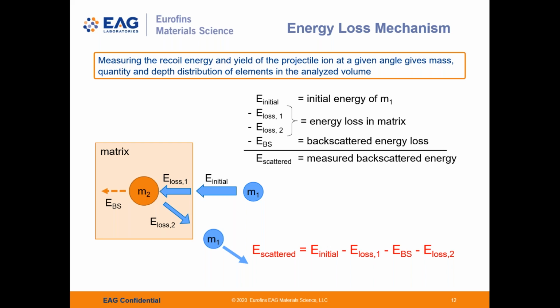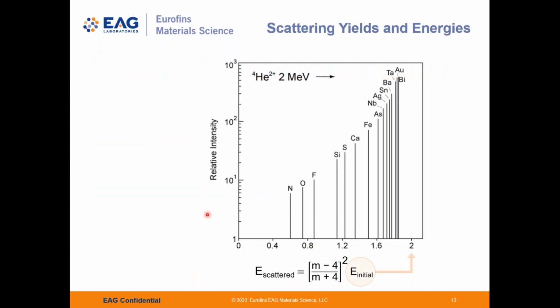Now, let us begin with the case of no energy loss due to transmission through a matrix, just atoms of different masses and sizes at the surface of the sample only, in the next slide. This plot shows the response of various representative atoms having different atomic numbers, and therefore different masses and sizes, to an incident particle beam colliding with them at the surface.